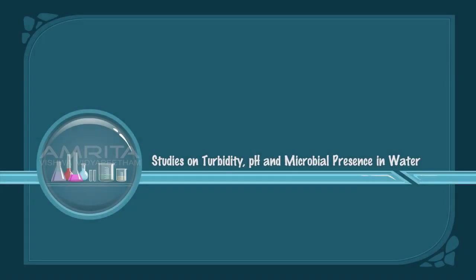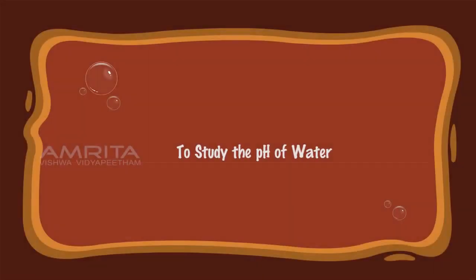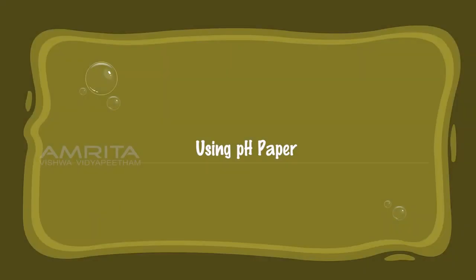on turbidity, pH and microbial presence in water. To study the pH of water, using pH paper.